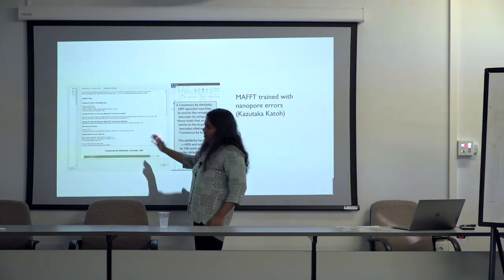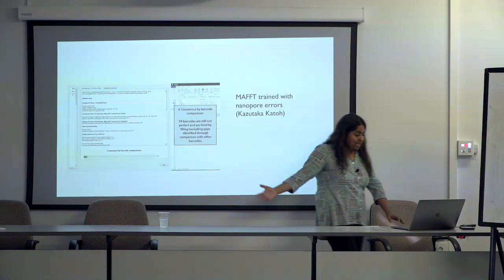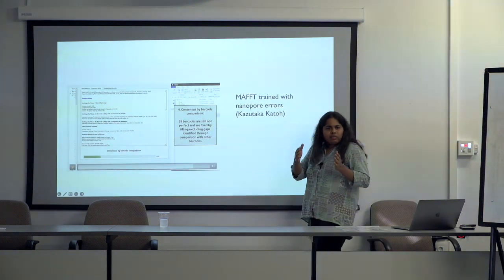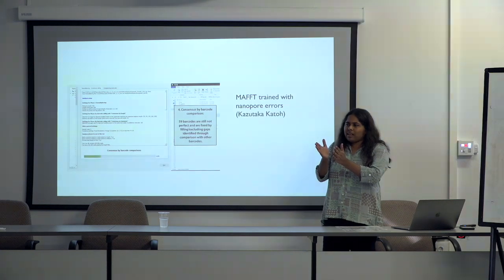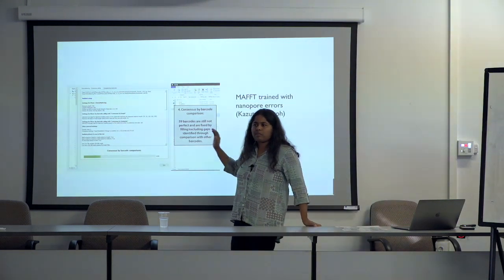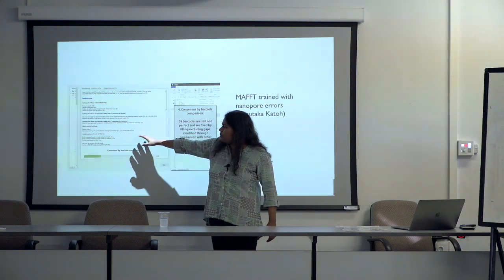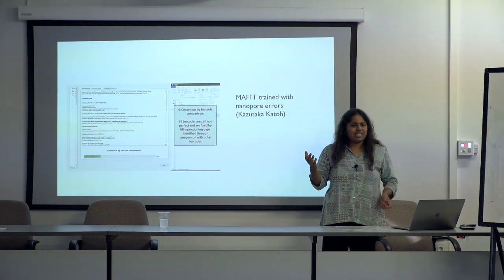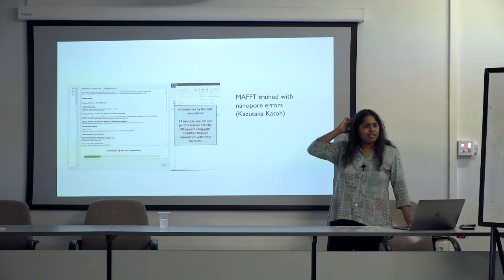Here we just do one iteration. We don't think that this helps that much. It does improve a little bit. And I think if you notice, from my understanding, this run you had something like 80 barcodes that were coming from consensus by length. You can observe how many you got for similarity, if anybody got that.